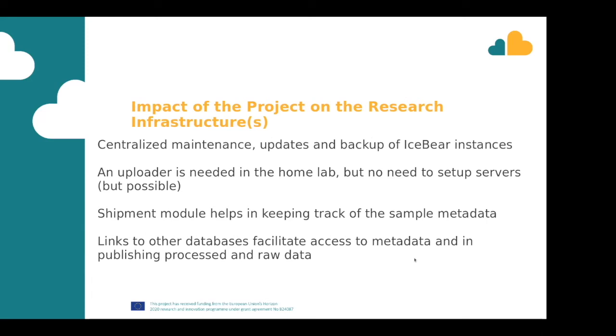So we have now centralized basically maintenance of these IceBear instances, and I think that's a clear benefit, because then we can run updates and also backups of these instances from one particular point. And we need an uploader to the home lab to upload the metadata and also the crystal images to the cloud version, but it's also still possible to put an offline version of the server, of course.